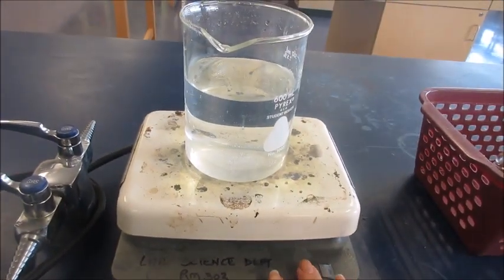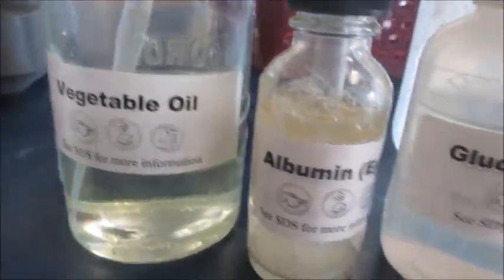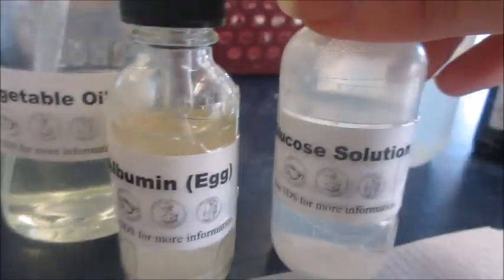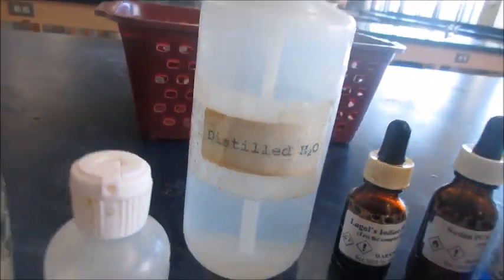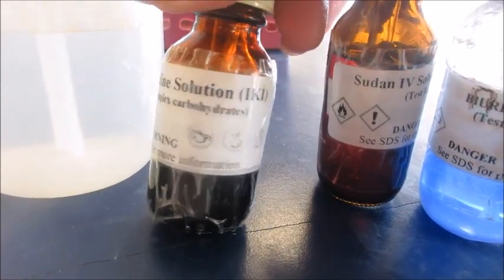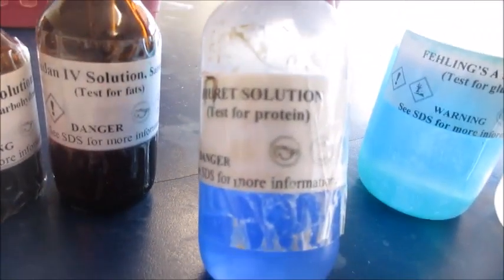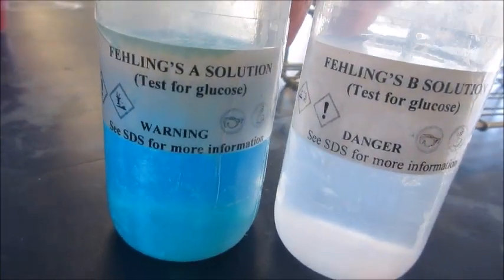I've already started heating it up. The various nutrients we'll be testing today are starch, vegetable oil, albumin of an egg — or protein — and glucose solution. We'll also be testing water as your control substance. The nutrients will be tested using these particular tests: we have Lugol's iodine solution, Sudan 4, Biuret solution, and Fehling's solution A and B for glucose.